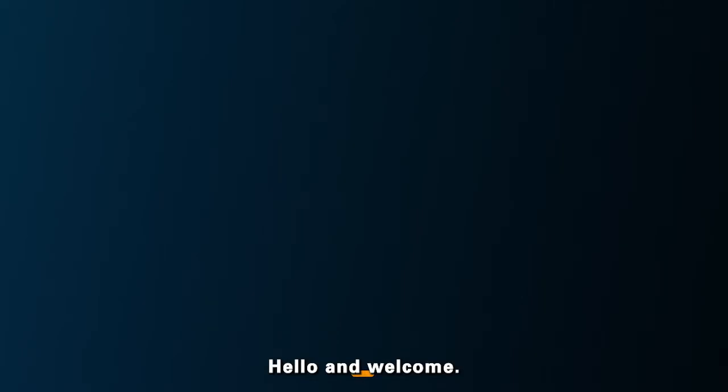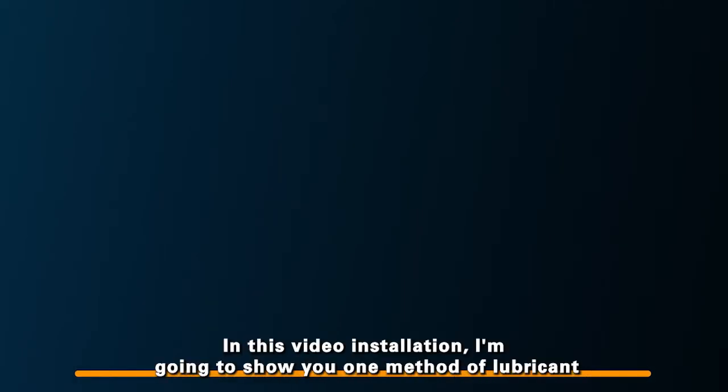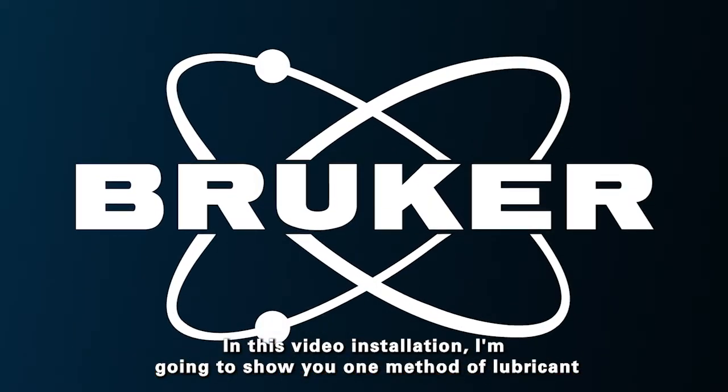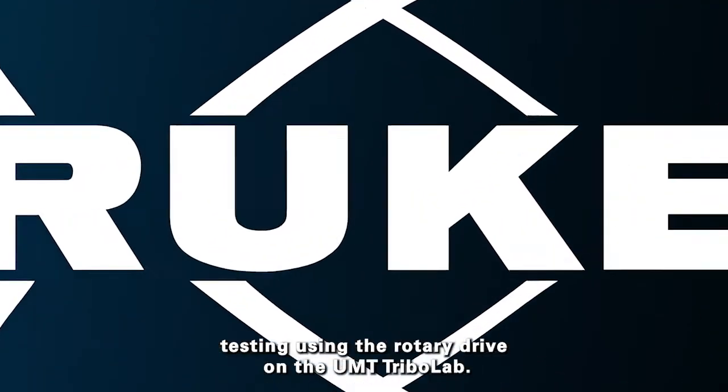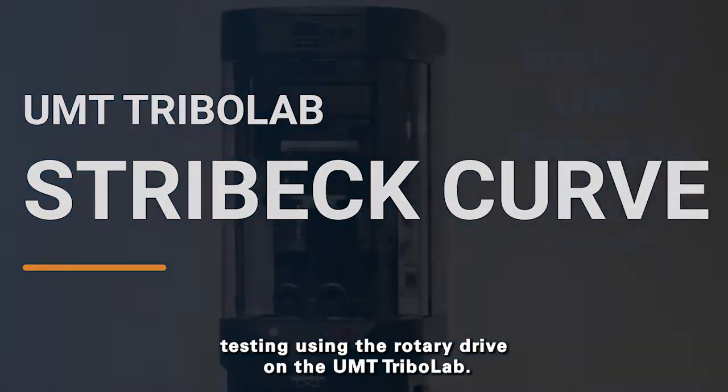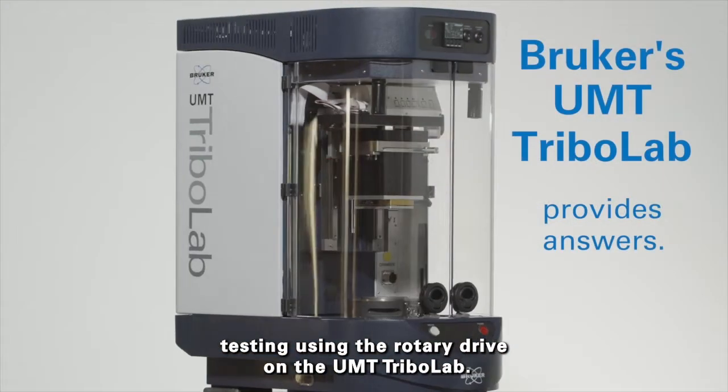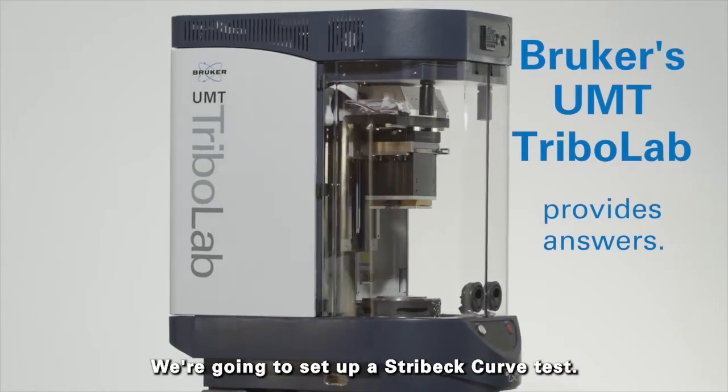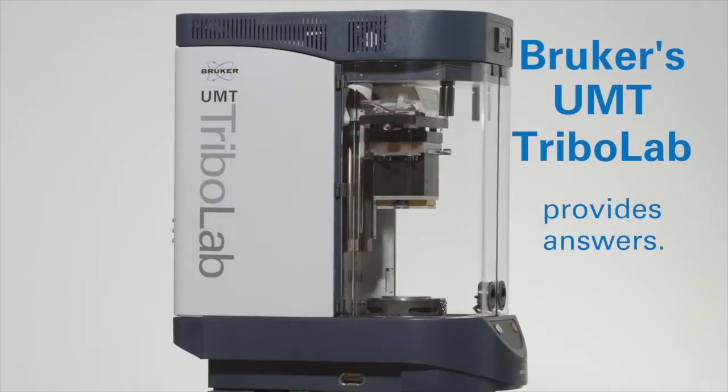Hello and welcome. In this video installation, I'm going to show you one method of lubricant testing using the rotary drive on the UMT Tribolab. We're going to set up a Stribeck curve test.